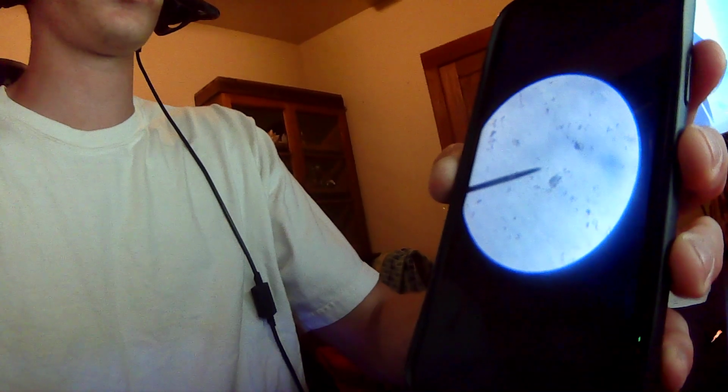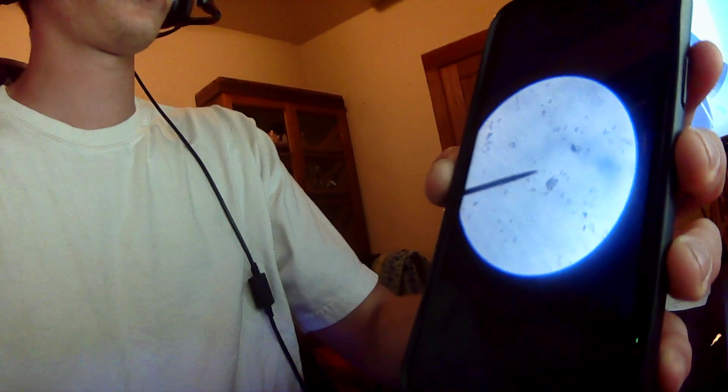Again, it's a little out of focus, and I apologize for that. There's not much I can do in that scenario. But it's much less jagged, like in a spirillum shape, like the dental tartar. But ultimately, I think it was very easy to find.